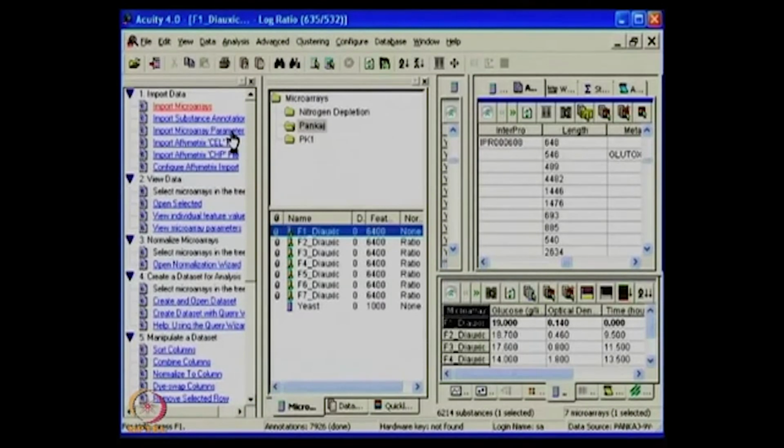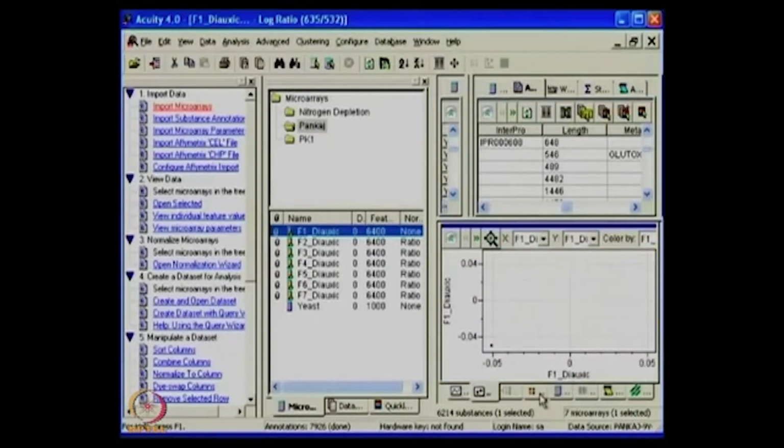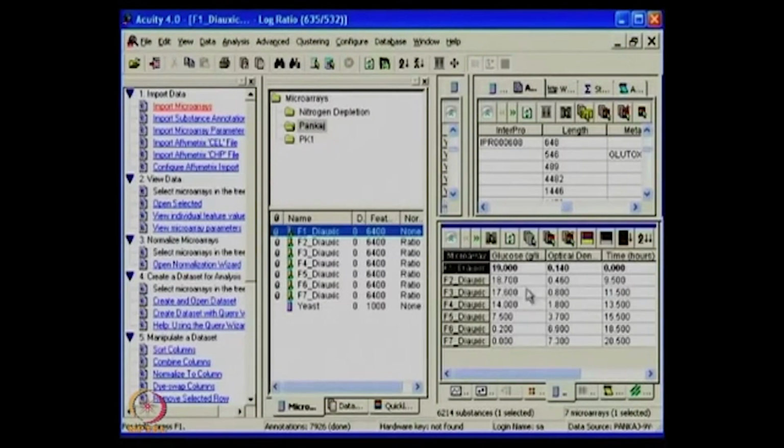Right. This can be made again in the text delimited form and can be renamed to .mdt file, and this again can be imported to look at. All the parameters are visible in the form in the down window here to look at. In a few seconds more you will understand what each window means, but as it is, you can just switch over to different types and go to a parameter file and look at what all details I have.